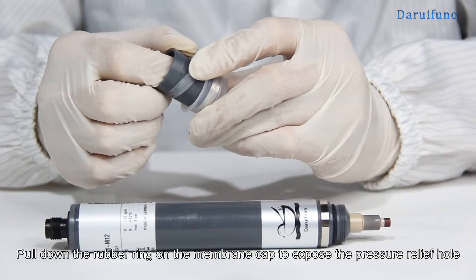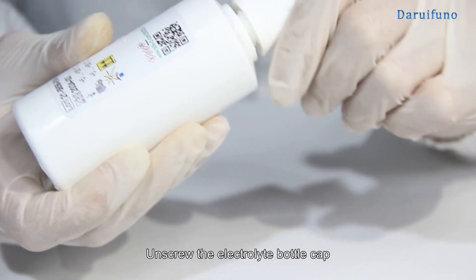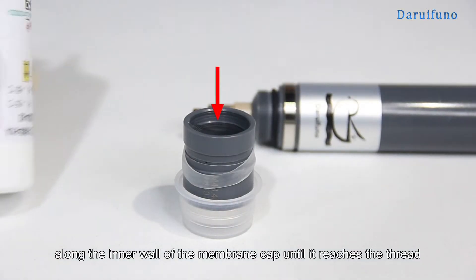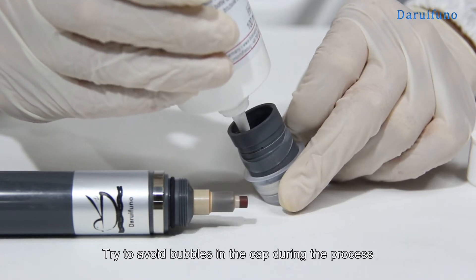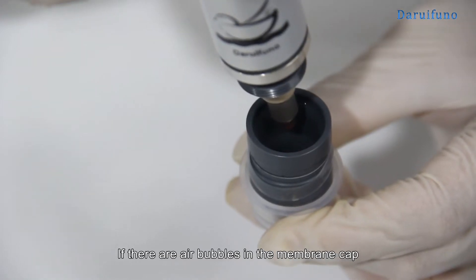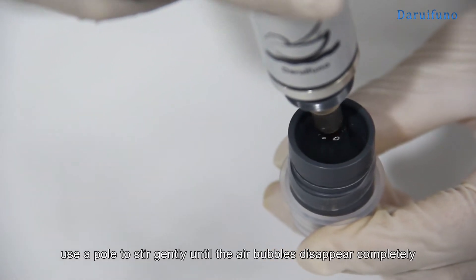Pull down the rubber ring on the membrane cap to expose the pressure relief hole. Unscrew the electrolyte bottle cap and fill the electrolyte along the inner wall of the membrane cap until it reaches the thread. Try to avoid bubbles in the cap during the process, as this will affect the measurement accuracy. If there are air bubbles in the membrane cap, use a rod to stir gently until the air bubbles disappear completely.